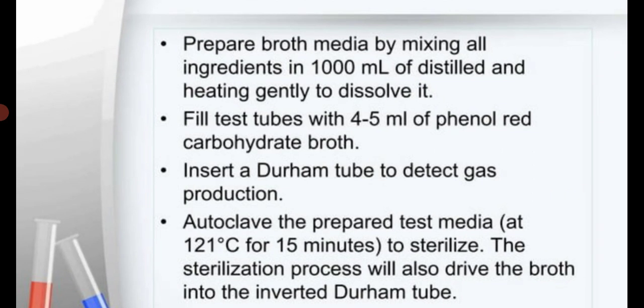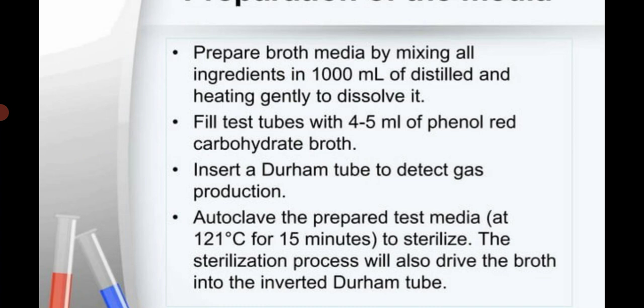For preparation of sugar fermentation media: all ingredients are weighed properly and mixed in 1000 ml of distilled water. They are dissolved by gentle heating. After dissolving, tubes are filled with 4–5 ml of this medium. Durham tubes are inserted in each tube for gas detection. All tubes are plugged with a cotton plug and placed for autoclaving at 121°C for 15 minutes. The autoclaved media gets sterilized.